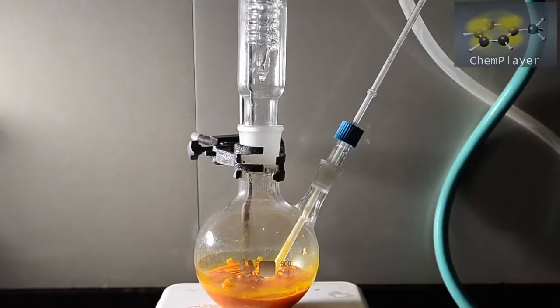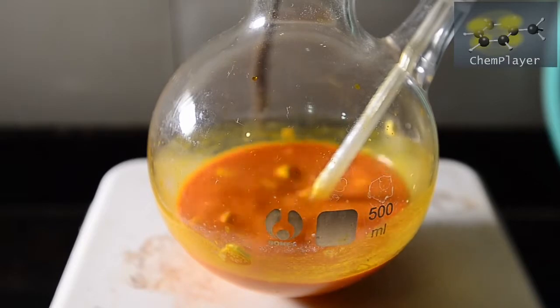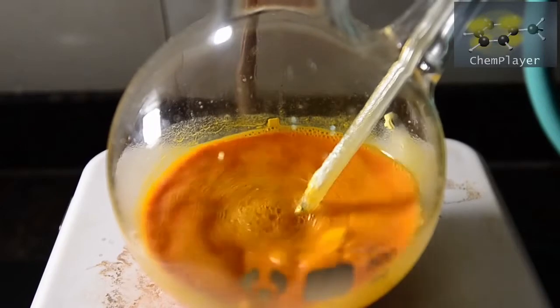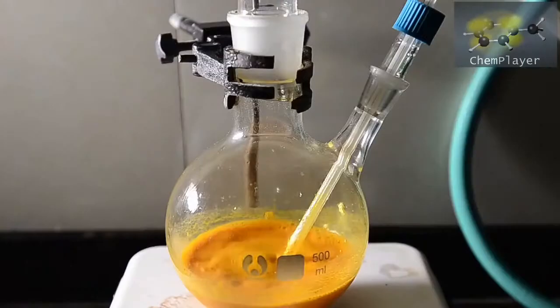Then we set up a reflux condenser and gently began to heat the flask up to the boiling point of the dichloromethane. Slowly we could see the color of the liquid changing to a paler orange, and the lumps of sodium propionate began to break down. And pretty quickly we've got a nice gentle reflux going on. We left this refluxing for the next hour.